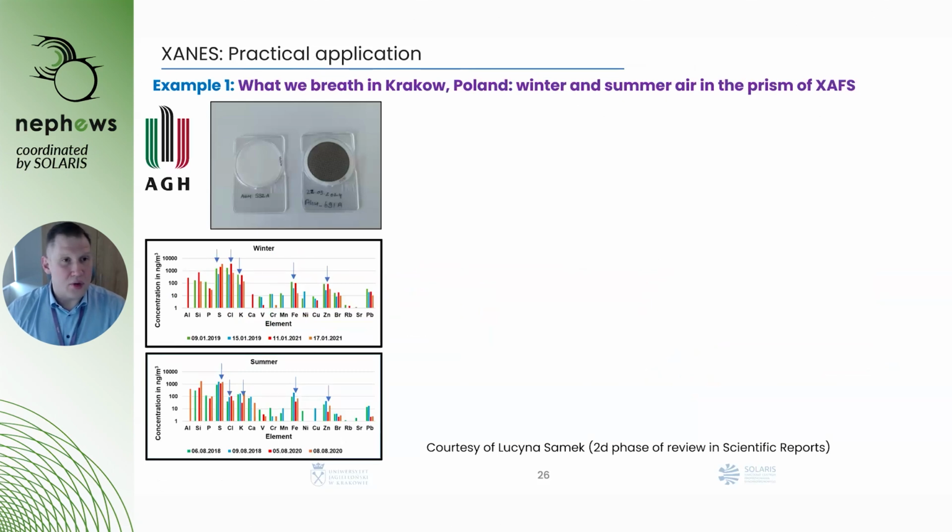And let's go to the practical applications. One of them is an example which allows us to investigate the quality of the air in Krakow. Here on the slide you can see filters which were used in order to get the sample, so to get the particulate matter from the air.